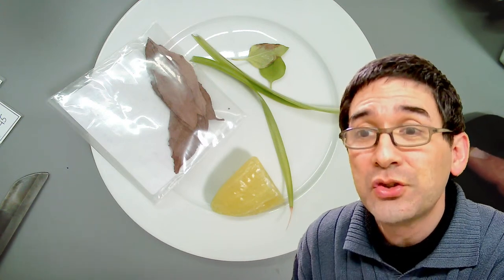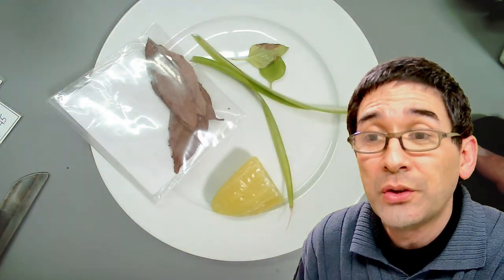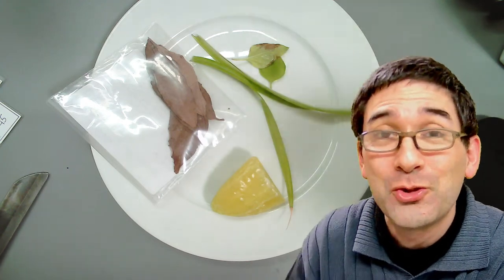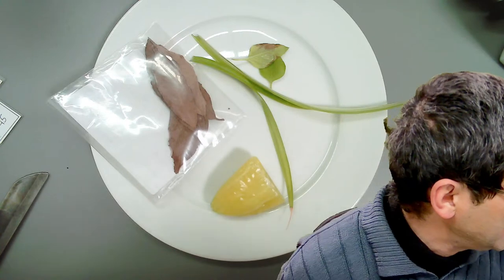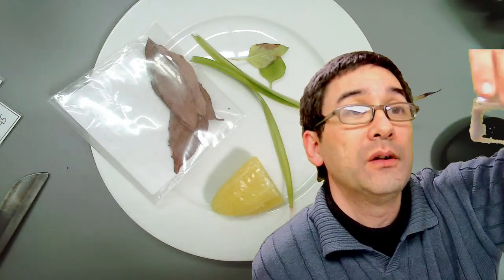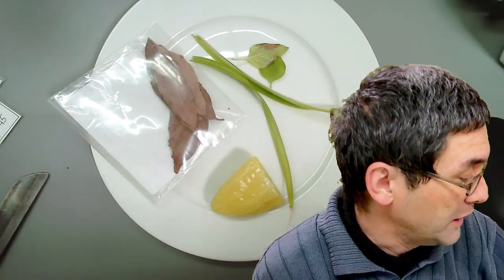Pond water makes great samples. If you want to observe pond water, do not just observe the water itself but take some of the sediment from the ground, because in the floating water you won't find so many things, but on the ground a lot. Brine shrimp are cool to look at. I made a live stream last week about those. Are the brine shrimp still holding their breath? No, I overfed them and they died, but I made a second sample and they are living.